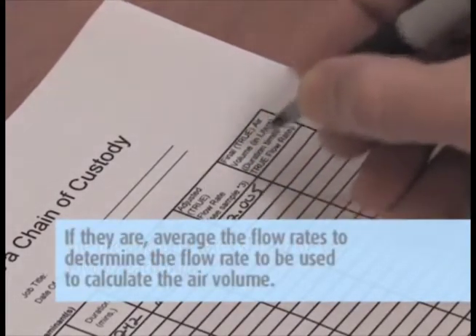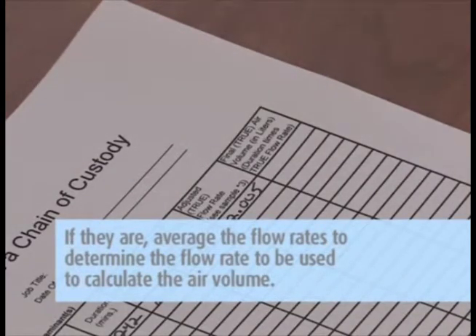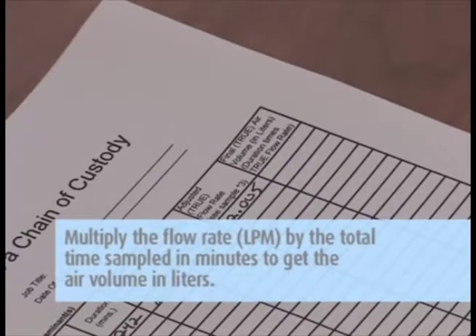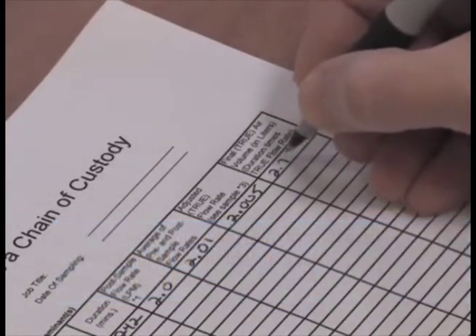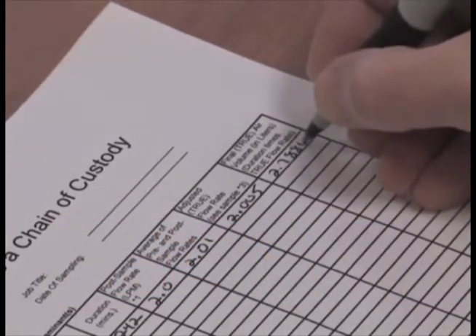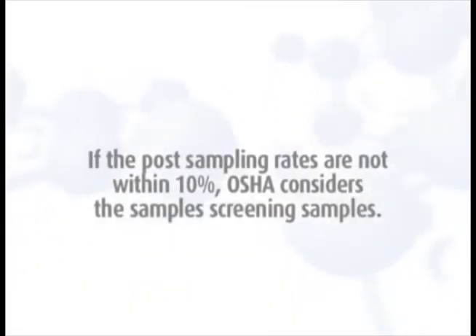If they are within 10%, average the flow rates to determine the flow rate to be used to calculate the air volume. Multiply the flow rate (LPM) by the total time sampled in minutes to get the air volume in liters. Record the total liters on the field pump data sheets and the chain of custody.